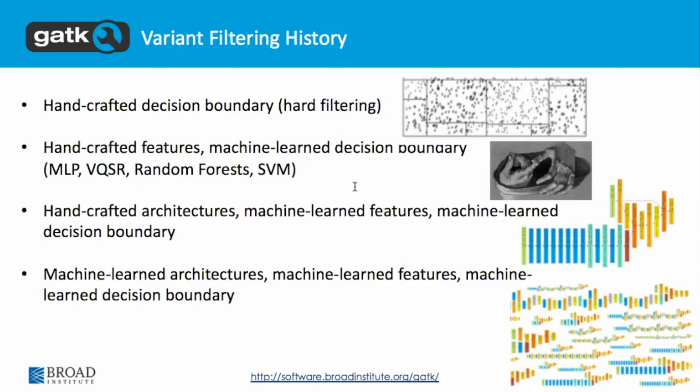However, that doesn't take advantage of any sequencing information at all. We're just looking at a few covariates that that particular variant has, but we can also take advantage of the sequencing context, and that's what the more modern approach, also implemented in GATK, does.